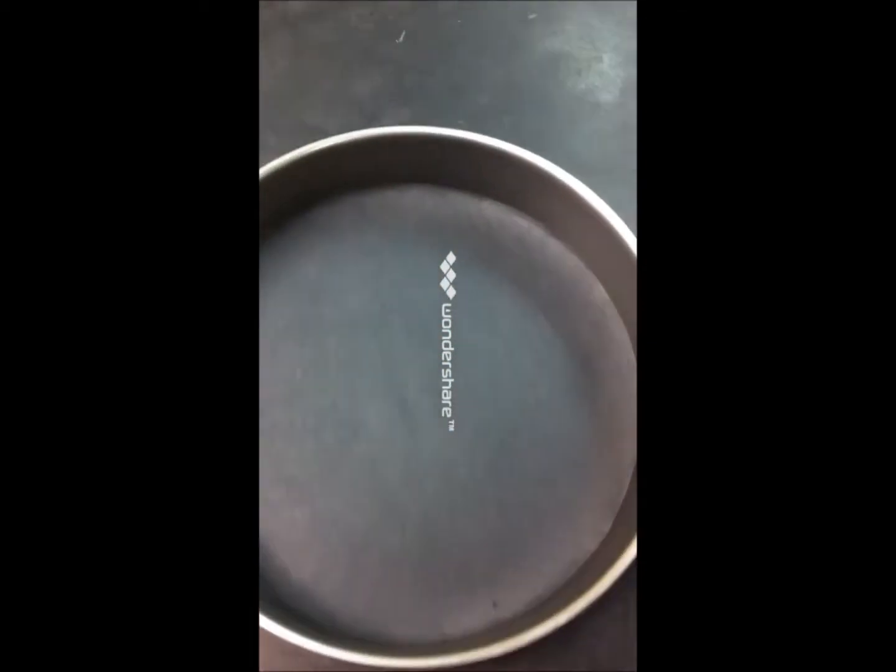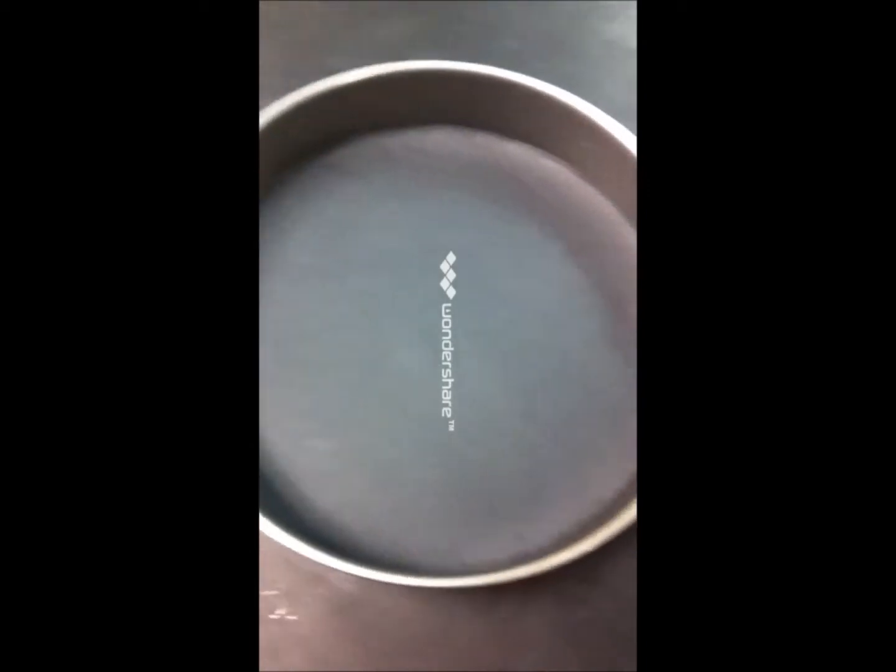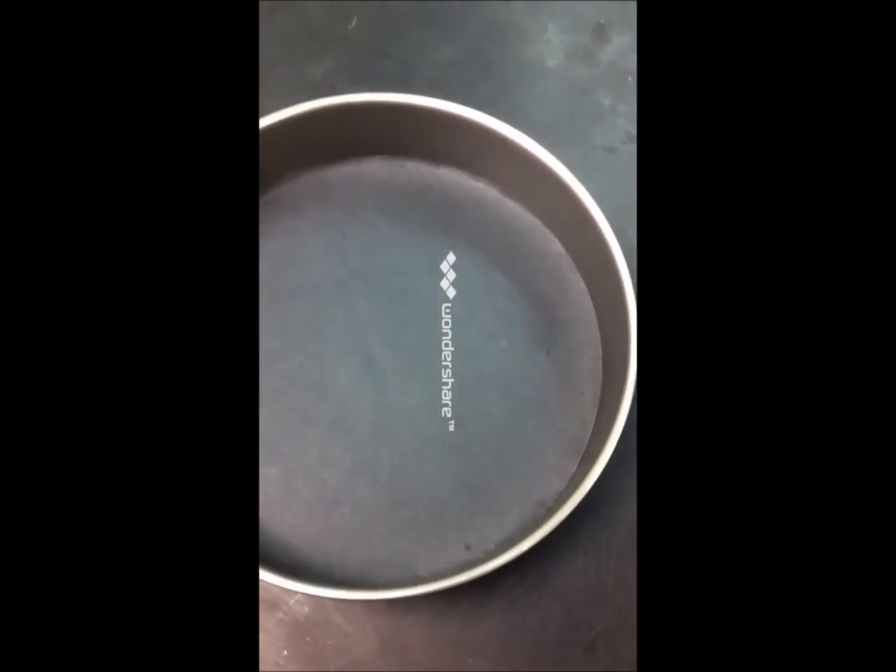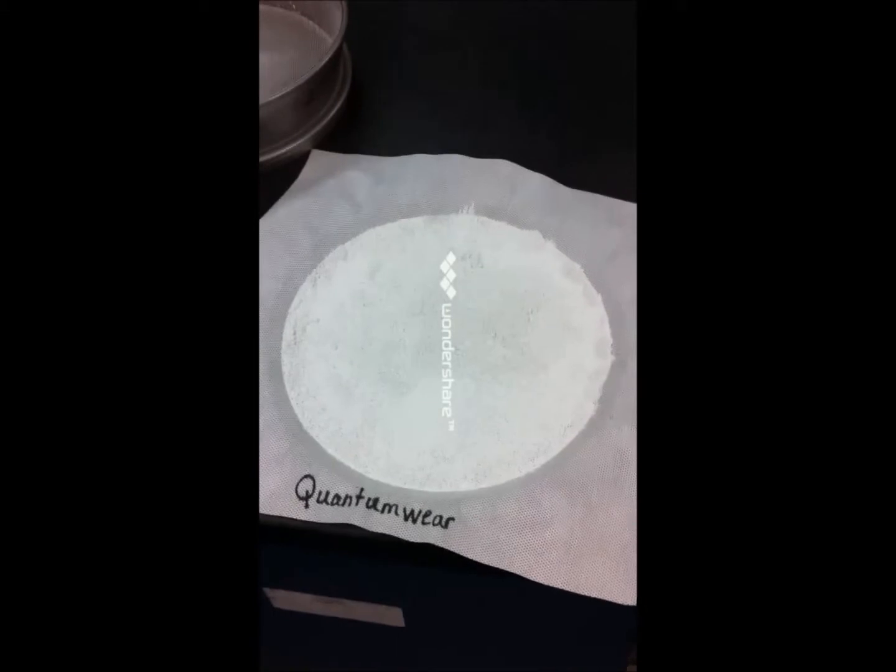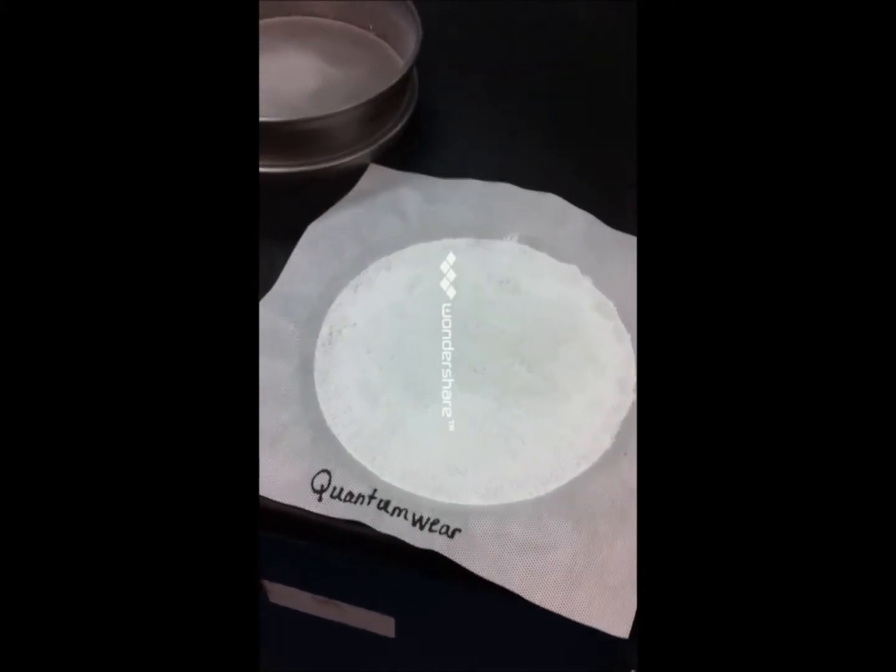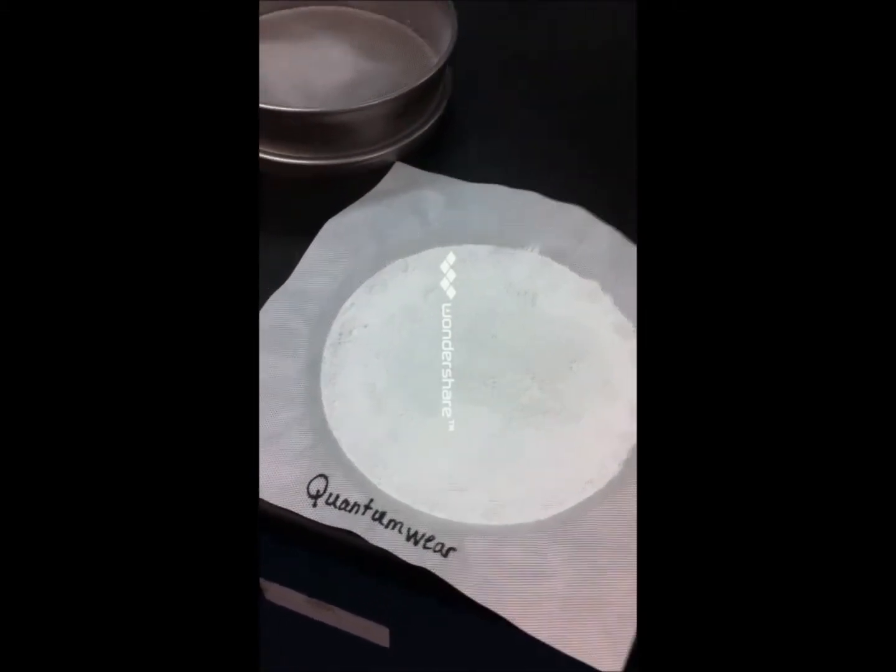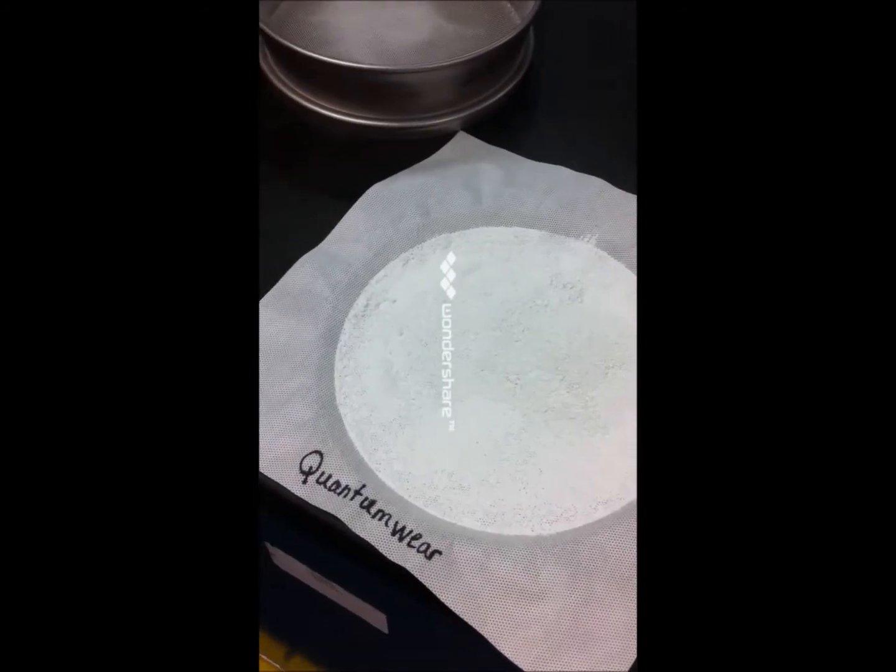And as you can see, there is nothing that has penetrated. None of the talc powder has penetrated the quantum wear fabric. It all remains on the top after 30 minutes. So you can see there is a significant difference between this fabric and the OREX Deluxe. Thank you.